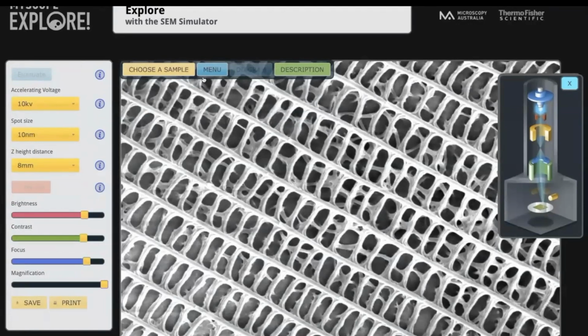In this case, what you see here is that where there is a bright area, there is a very high material content. And for scanning electron microscope, you need a conductive material or a conductive coating, such as gold, iridium, or carbon, or any sources, a very thin layer of that, because you need to generate the secondary electrons or backscattered electrons.